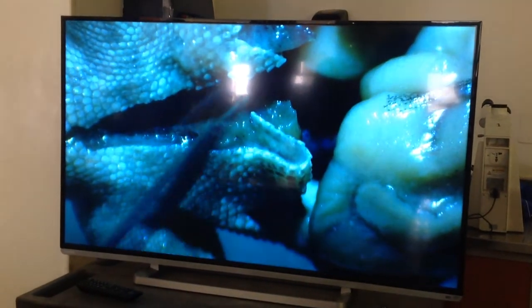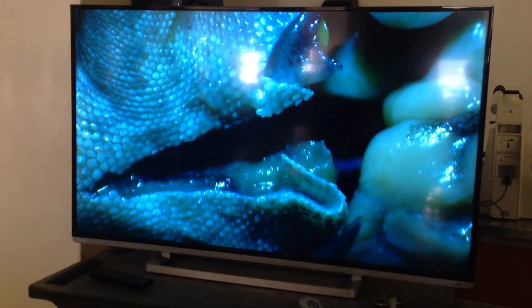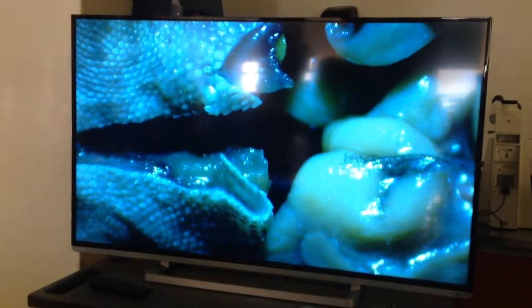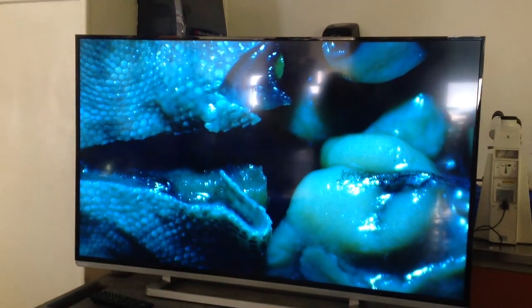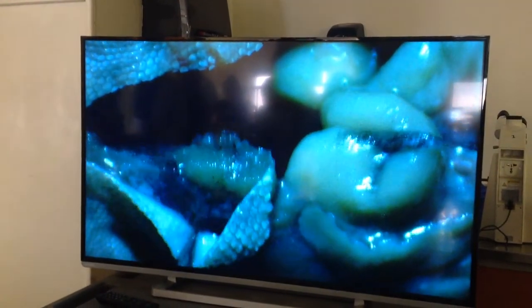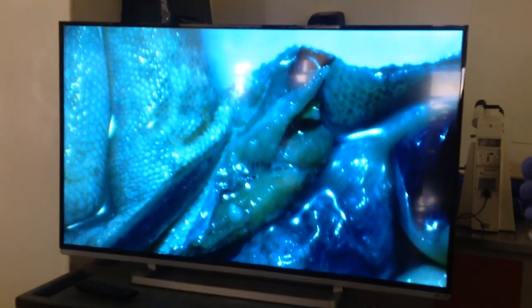So much of the rest of this is small intestine. The only thing I wanted to show you now before I start digging deeper is the cloacal gland. I cut through the cloaca here. I cut right through the middle of it — on the other side you can see the other half. See, that's a cloacal gland right there.